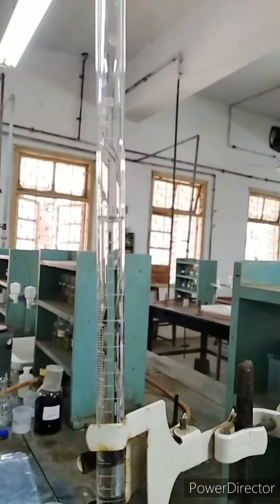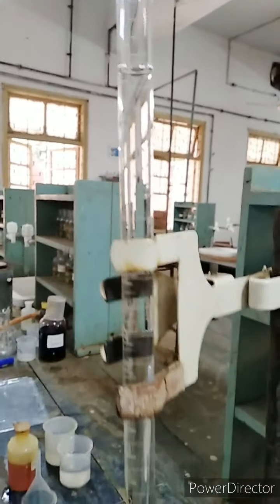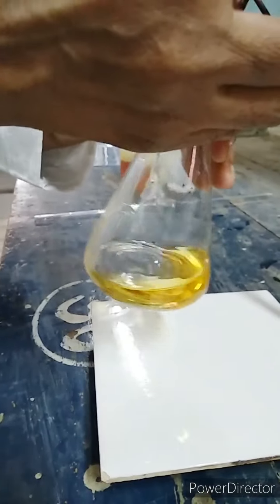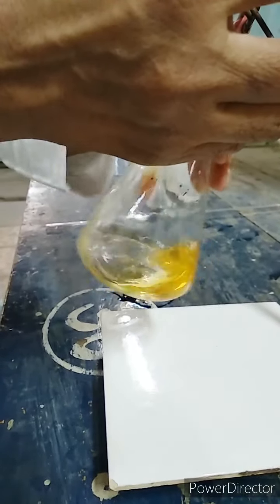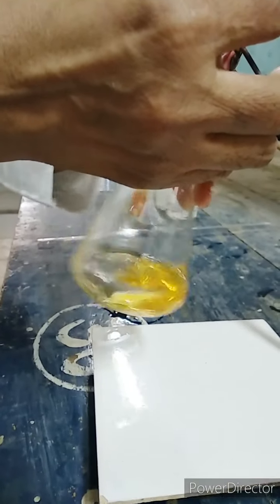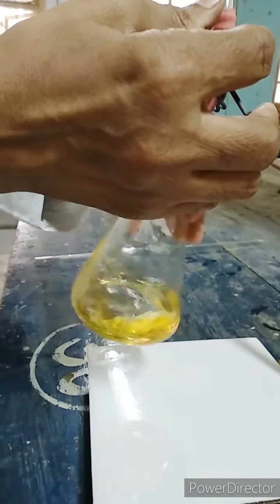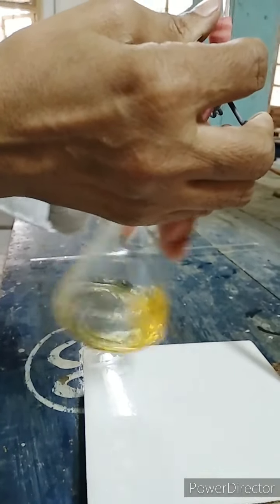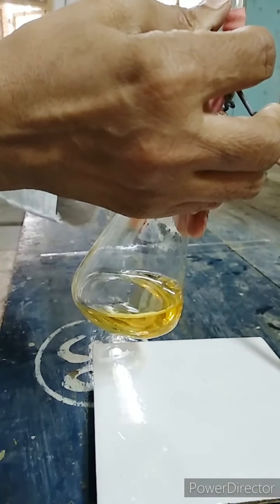Then we will start with the titration. Drop wise we will pour the HCl solution and shake it thoroughly, simultaneously watching for an orange color.